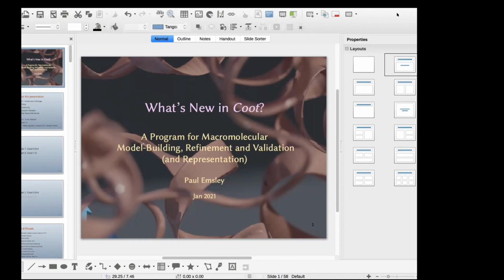Well, that's great. Yeah, I didn't even give it a shot. I know I'm not going to be in the running. I'm too slow. But for those of you who are still on, you can Google it. It's on Coot BB, the Coot mailing list. You can join up on that list too. It's also on the blog. So you do Coot blog and then follow the link to the speedrun, and you can assess your Coot speedrun skills.